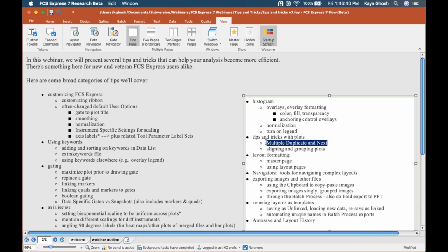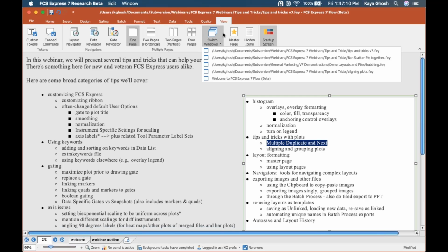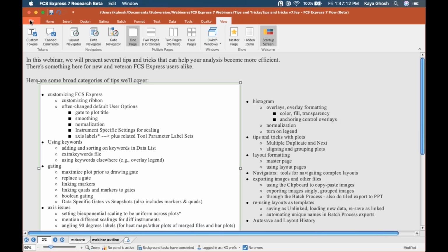For example, if you're doing a time course and you've got 10 different time points from 0 hours to 48 hours, and you're checking the sample every few hours, and you're doing some sort of regression, then you really do need to see each plot side by side in the layout at the same time, because you're comparing them, and maybe you're making a regression curve, like an IC50 or something like that. Or a drug concentration test. So the example I want to show you today is basically a titration.